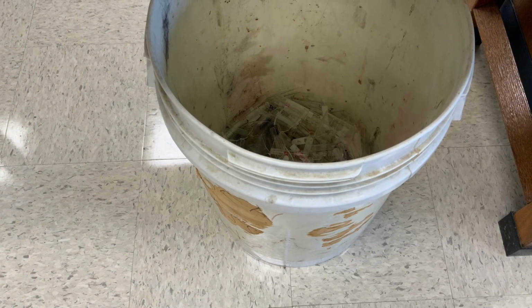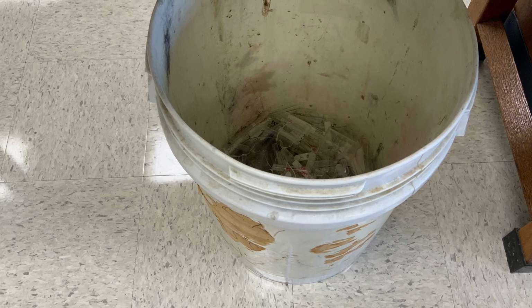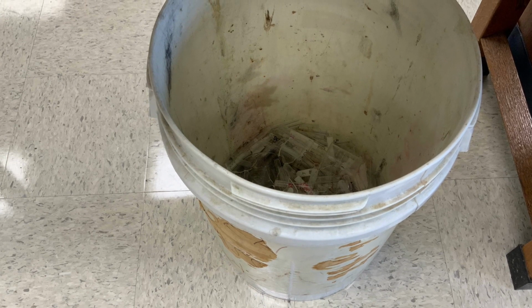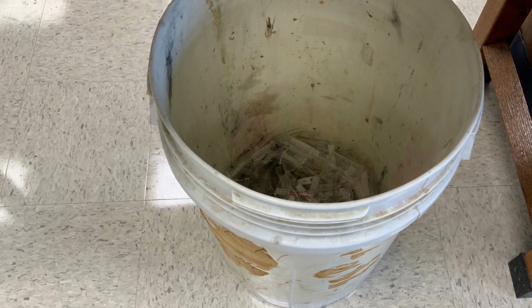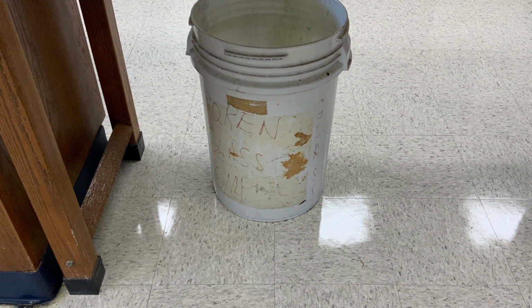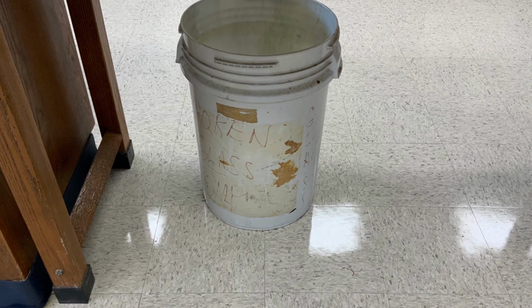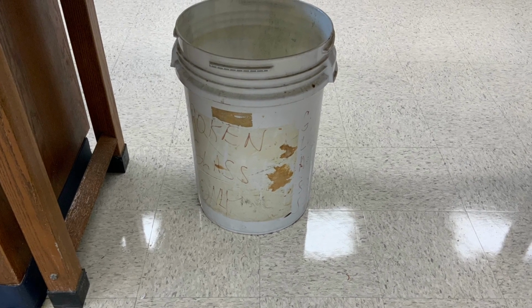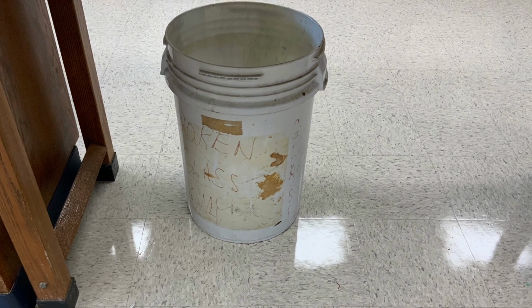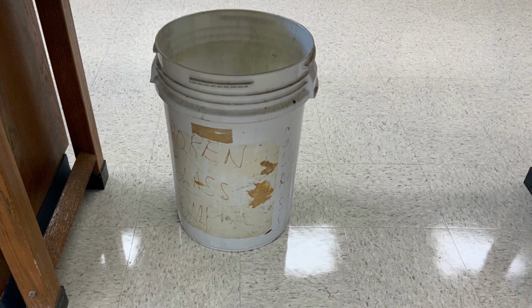Next, we got the broken glassware container. This is to be used whenever glass is broken in the lab. It's swept up into this container, and we have a special container for it just to make sure that we always know where to put it in case something does break. And obviously, we don't want random shards of glass on the loose, so we just sweep them up, put them in there, and that's where they will remain.